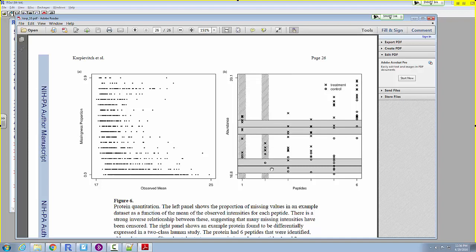If we went and searched for this particular peptide, it only showed up for one of the controls. So that just means it was not identified. It might have been present in the samples for those people, but just by chance, when we scooped out the material, we didn't catch any of it. Or it was present in our sample, but it was at too low of a level for it to show up in those mass spectrum peaks. It was too noisy down there. One way or another, we didn't get a number for this for many of the controls.